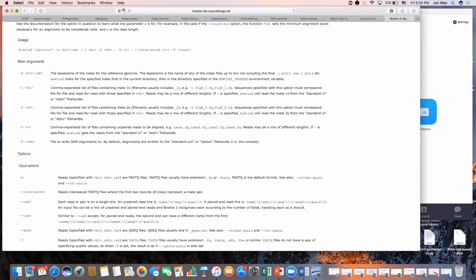So does that help? Does that make sense for how to write that index? Once you knock that step out, this thing runs like a piece of cake. I mean, you'll be amazed. Do you guys remember how long it took you to go through the alignment process with BWA? It was about 45 minutes, an hour, maybe a little longer. When I did the control FASTQs to the SAM, I was done in 7 minutes. I mean, it's that quick. It's really efficient. It's because of the way it breaks down that reference file into those indexes and compresses everything. So the hardest part is the index. After that, it's a home run, guys. Bowtie 2 is great.